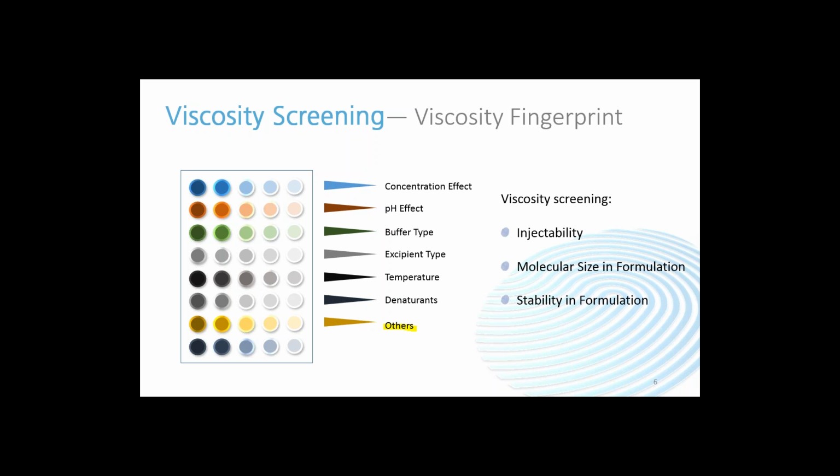This way, viscosity screening or viscosity fingerprinting can be used to determine drug performance in terms of injectability, molecular size in a given formulation or conditions, and stability in a given formulation or conditions.